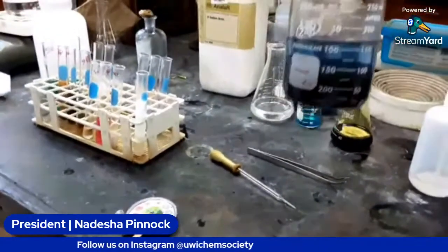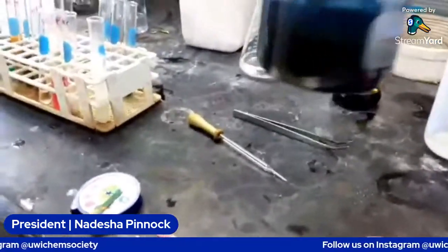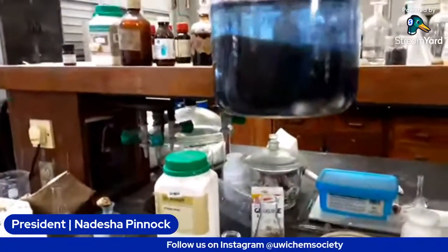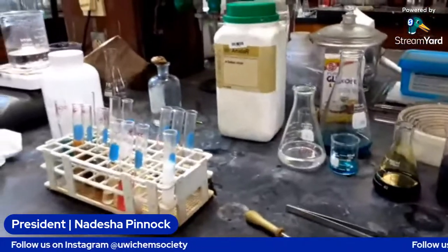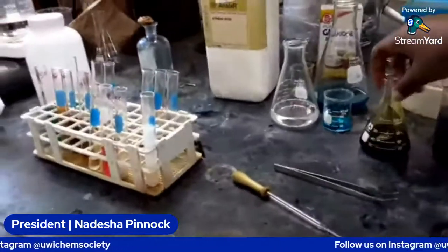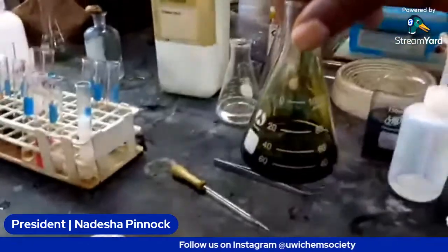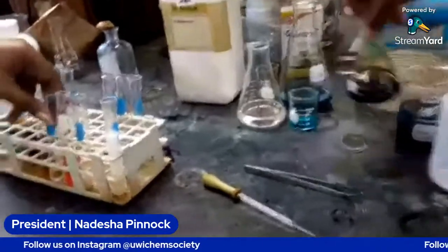The chelating agent is sodium potassium tartrate, which we did not put, which is why our solution is separating like this. For our iodine starch test, we used Lugol's reagent, which is 5% iodine and 10% potassium iodide.